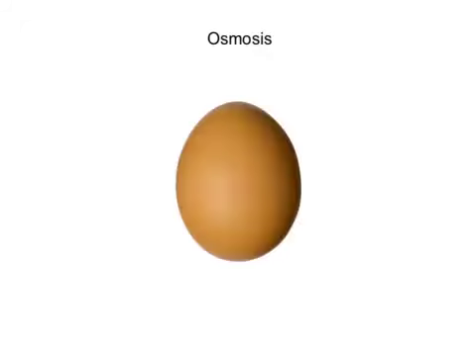If we look at osmosis, let's take a look at the example that we did in the lab, or at least that we tried to do in the lab. Let's take a look at an egg. The egg looks simple. It has a nice shell. It has a nice oval shape. Actually, the largest eggs are the largest cells in every vertebrate's body.